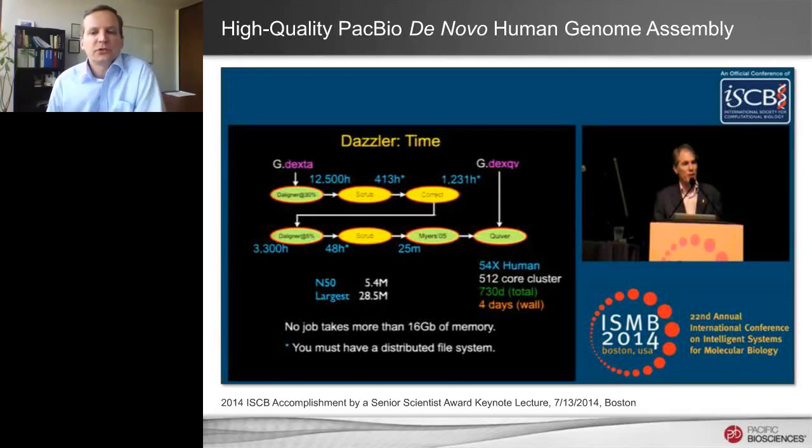Other efforts in terms of the bioinformatic analysis are ongoing. This is a talk by Gene Myers, so you know Gene Myers from the original Human Genome Project. Gene Myers then left sequencing, but then re-entered and now is using his 2 PacBio RS II instruments for de novo assembly of human and other genomes.